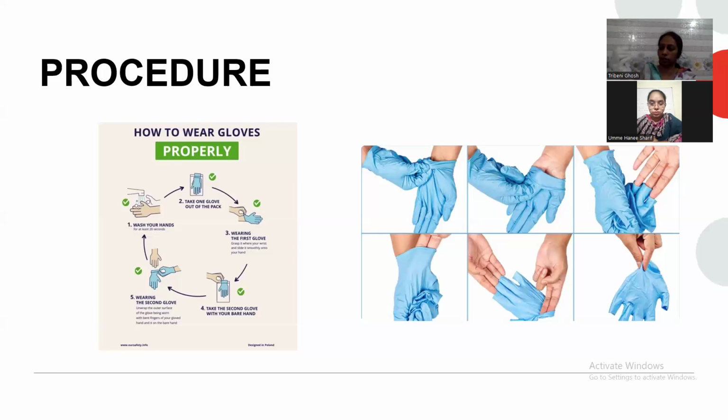It's pretty simple. Can you get it? So I took another one. This is how we wear our gloves.